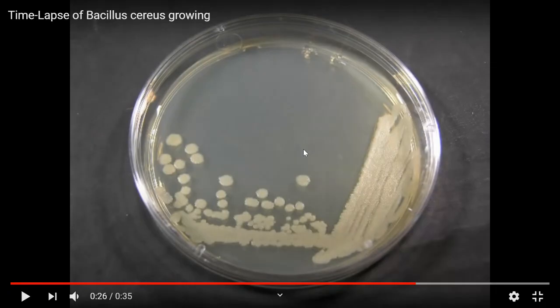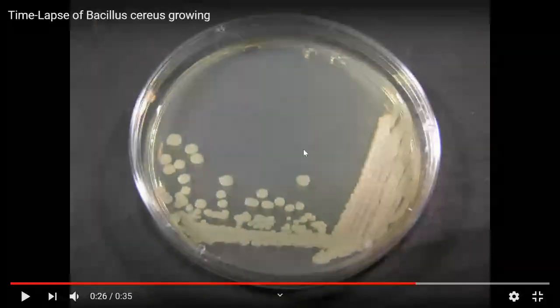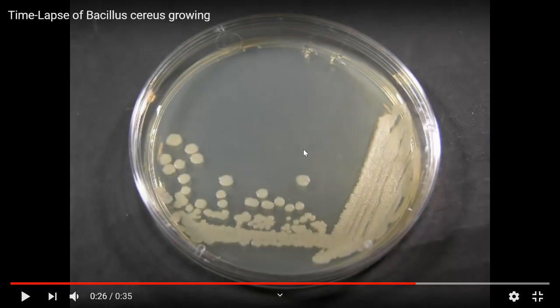Was it on the top? Right, the top half. So on an agar plate like this, where would be the best place to find spores? Where would you go to get your sample to make your spore stain?